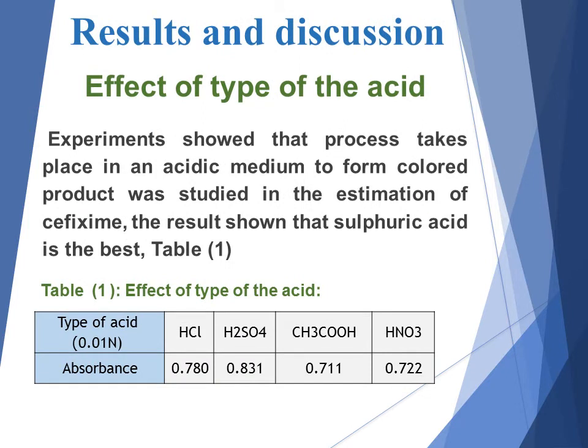Effect of type of the acid. Experiments showed that the process takes place in acidic medium to form a colored product, which was studied in the estimation of cefixime. The result shows that sulfuric acid is the best, as shown in table 1. Table 1, effect of type of the acid.